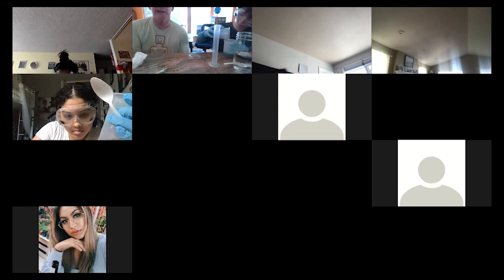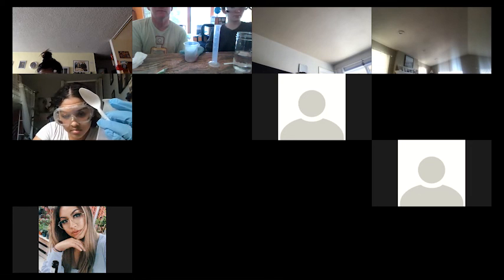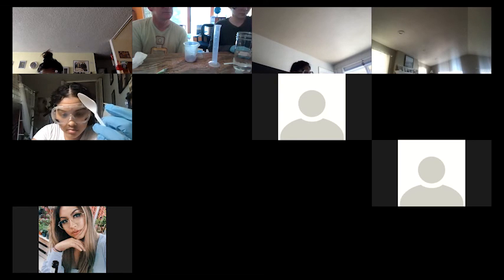Is everybody else doing it with us, or are you just watching? Francesca, are you helping? Are you doing it? I usually do my experiments on Thursdays because those are my days off. Oh, okay. What about you, Gordon? Are you working on it? I know Xiaoyi's working on it. Yes, I'm doing it now, I'm just waiting, the copper is thick.